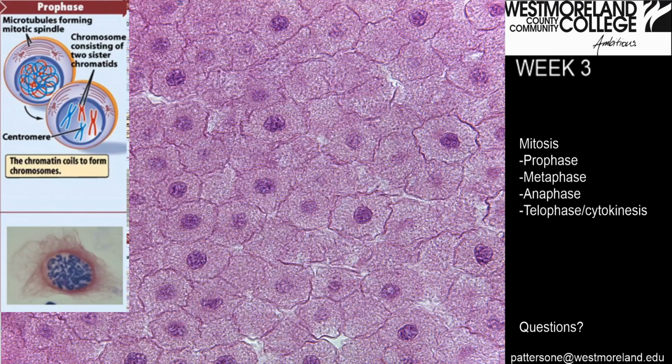Looking at this slide of fish mitosis, we can use our image from the SLM that has the nucleus at the bottom to compare to the nuclei on our slide. And we can see on this slide of the fish, all of those nuclei appear to be the same. They're still round. They maybe have some granules or some lobes within the nucleus that we can see, and most of them appear to all be prophase.